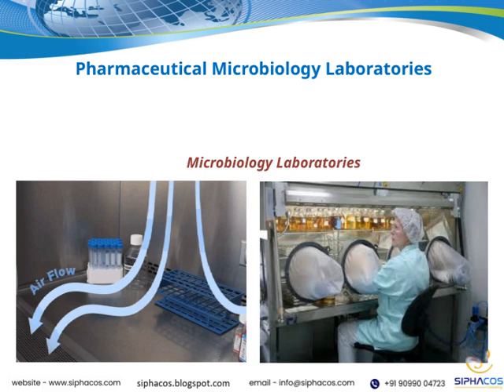Microbiology laboratories play a crucial role in identifying microorganisms, assessing microbial limits, and evaluating sterilization processes. They help us detect any potential microbial risks early on, which is vital for maintaining product integrity and patient safety. Throughout the presentation, we've emphasized the importance of rigorous testing and compliance with regulatory standards.